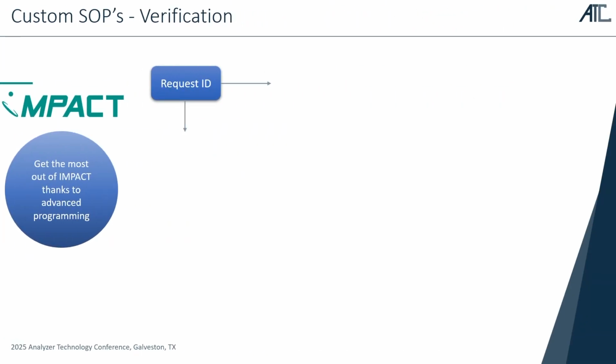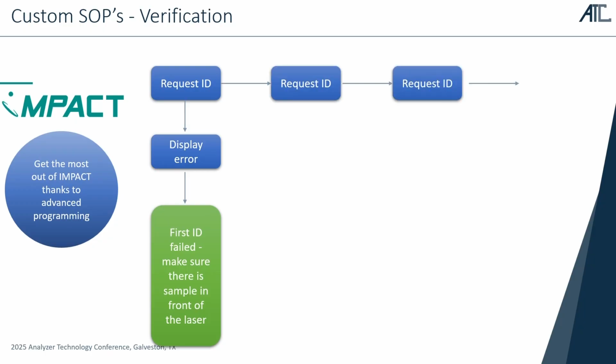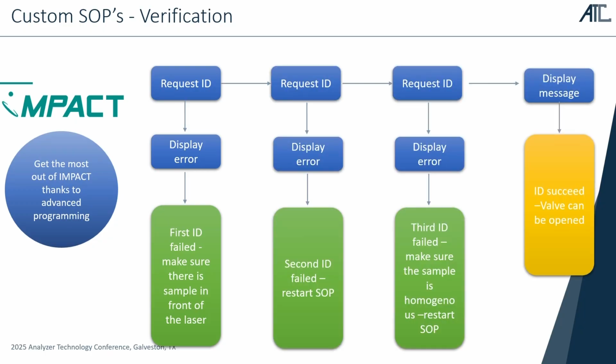I have this slide on how the software operates, because we do not want to rely only on that one passing result. So there's programming behind where you can build an average on 10 scans, or use 3 times passing results before you're allowed to open the valve. So all of that can be programmed and customized depending on your setup.